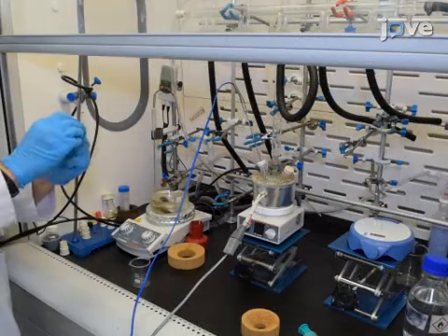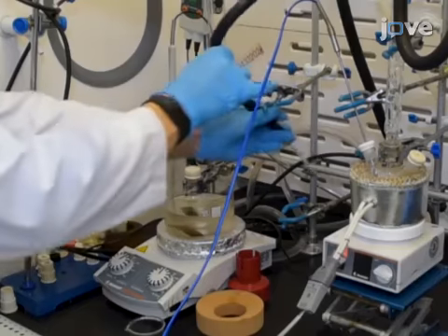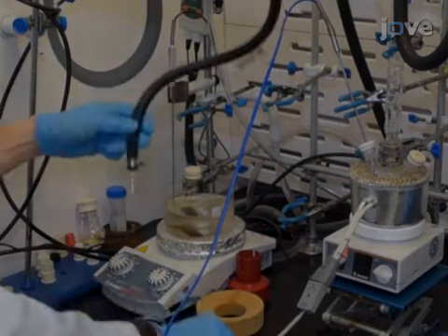Next, add 1.8 milliliters of a previously prepared TOP sulfide stock solution to a 10 milliliter single-necked round bottom flask and seal it with a rubber septum.